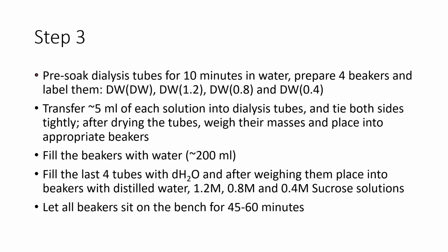Okay, so in the step 3 video you will be shown the pre-soaked dialysis tubes. In general they come very dry and firm, and you need to pre-soak them so that they become soft. In this case we pre-soak them for 10 minutes.